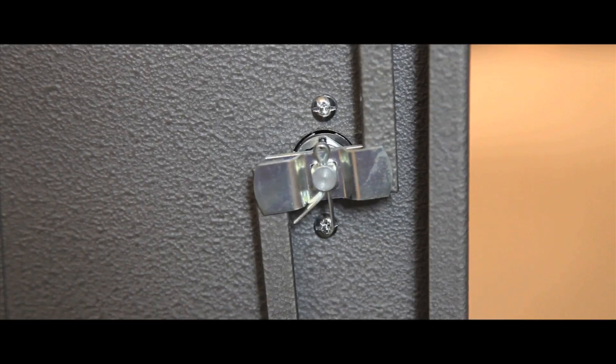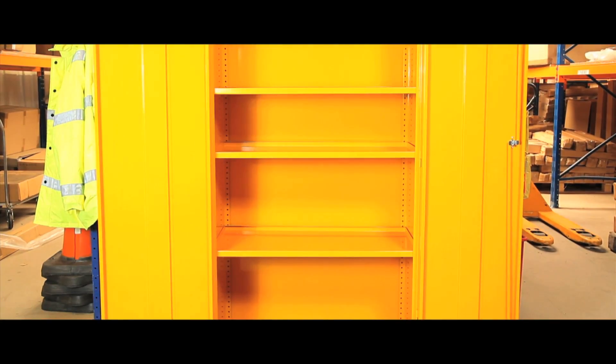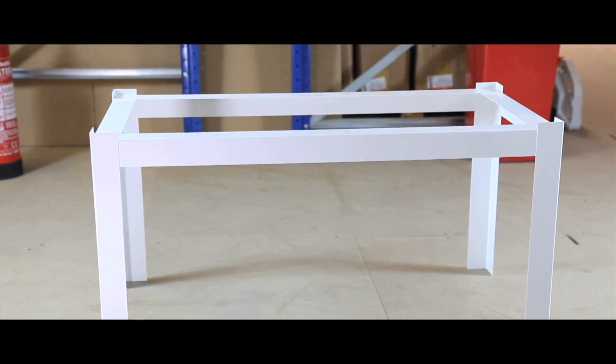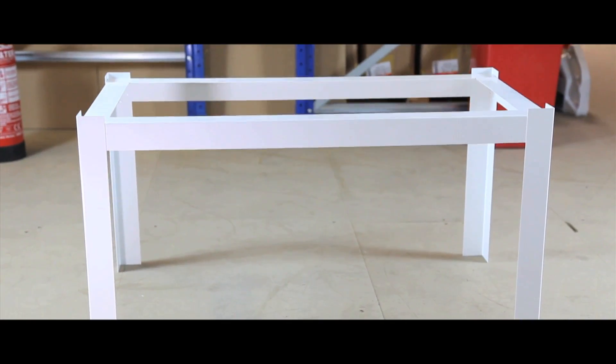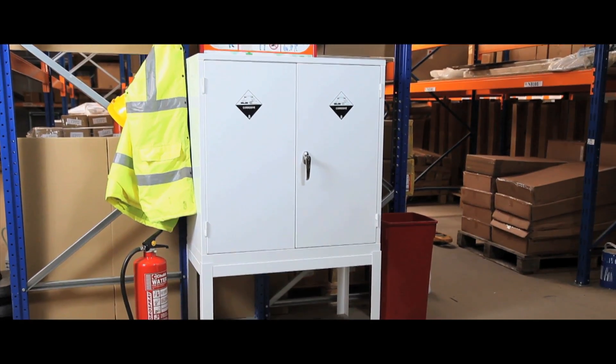with a two point locking system and one, two or three adjustable shelves. Stands can be purchased for smaller sized units if required.